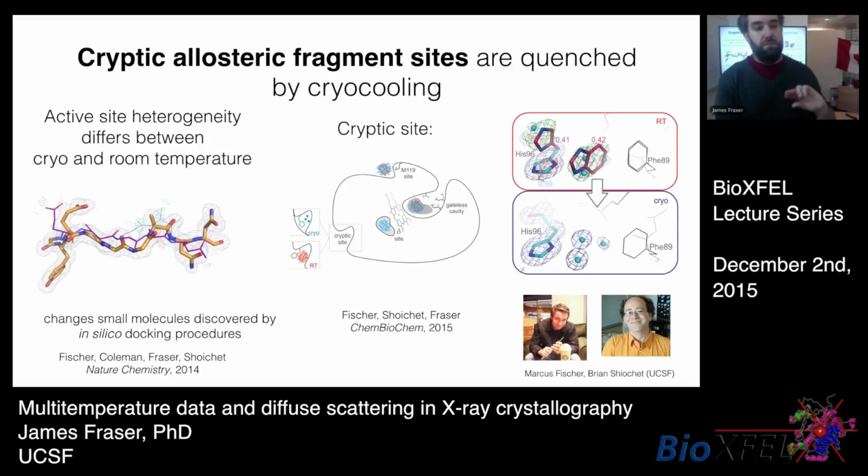And so, from these studies, we found changes in the types of small molecules that we would discover by these in silico docking experiments, as well as the types of sites that we could take advantage of in either directed small molecule discovery efforts or totally undirected ones, for example, in fragment soaking experiments.